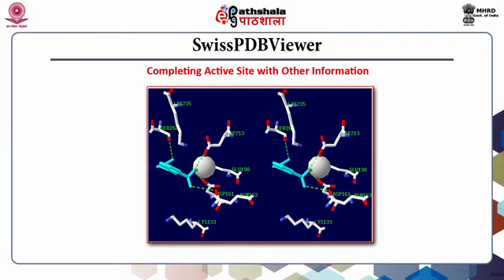Hide labels of OSB and magnesium ion. Now center display by clicking first button in the toolbar. This will display as shown in this slide. Lysine 133 and lysine 235 and the bound magnesium ions are the residues involved in actual chemical catalysis.